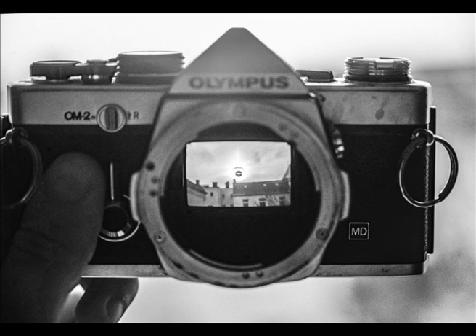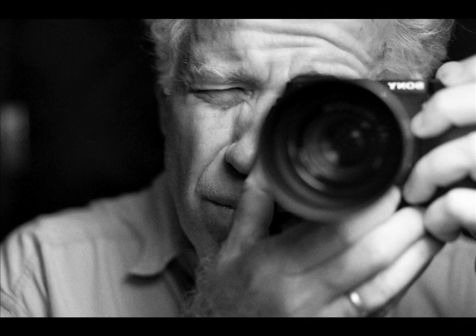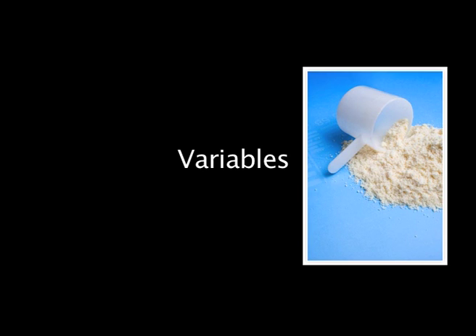The main goal of our experiment is to use different chemical concentrations and see if the film develops. Through the course of this experiment, the preparation and process of producing photographs on a photographic film will be determined along with its chemistry and the impact of processing photographic film on the environment. The purpose of our lab was to determine the percent of trypsin in a solution that would be the most optimal for photographic development. The independent variable is the concentration of trypsin in percent.